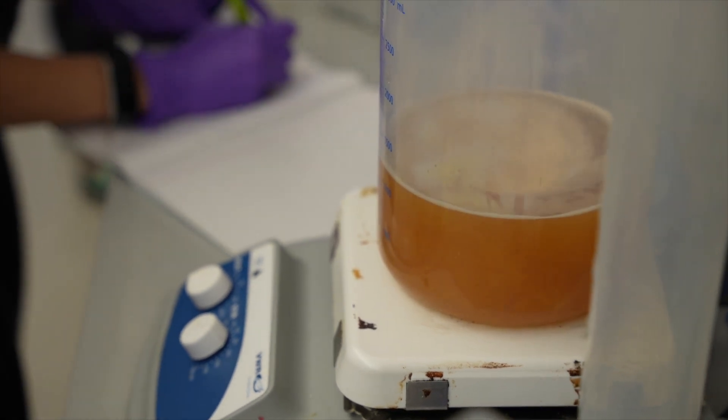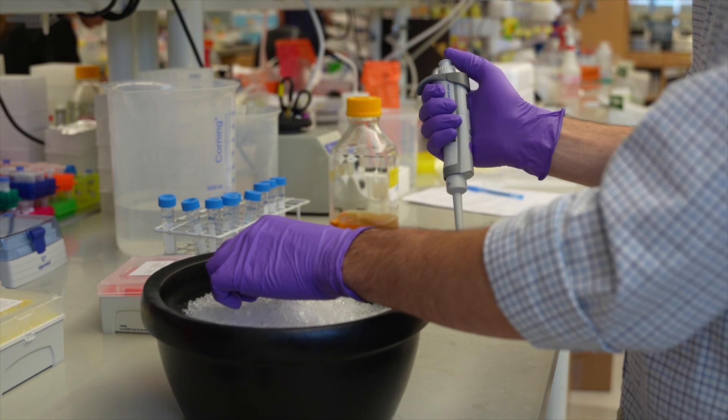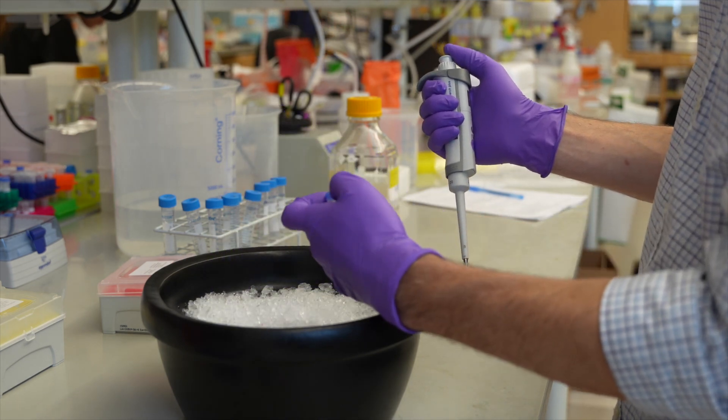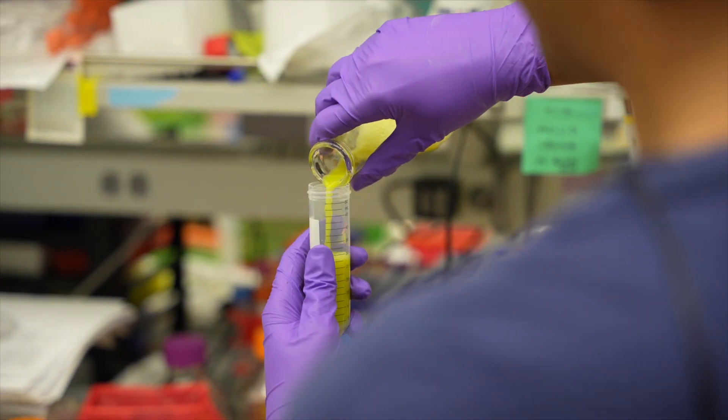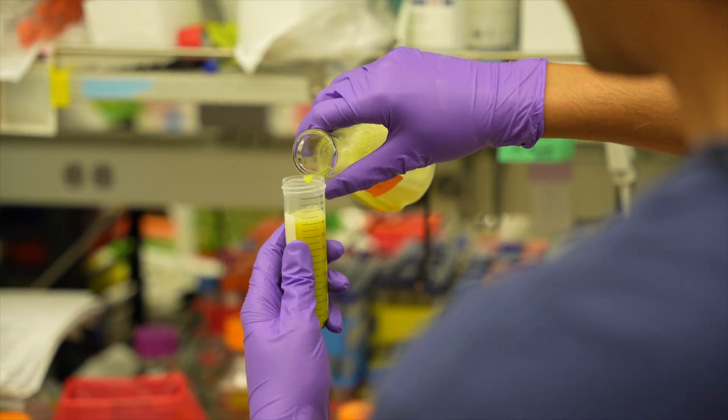But first, let's return to the lab and tell you more about what happened to your Foldit designs after a puzzle closes. In our previous two videos, we showed you how a Foldit player solution becomes a piece of custom DNA, and then how we use bacteria and various tools in the lab to turn that DNA into a sample of pure protein. Definitely take a look at those previous videos to get the whole story.